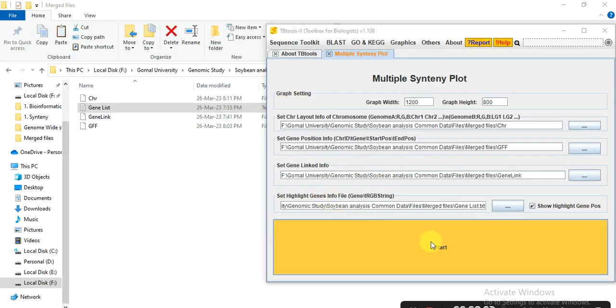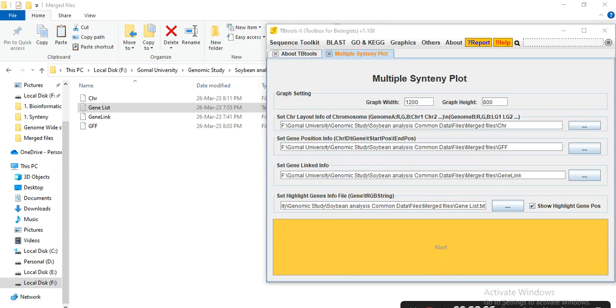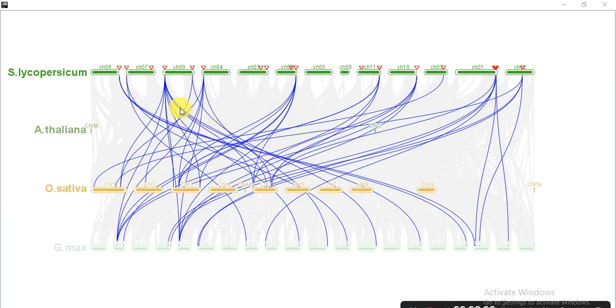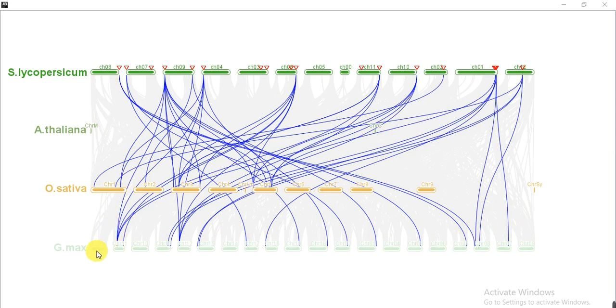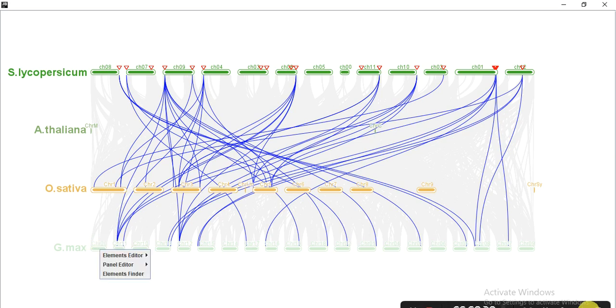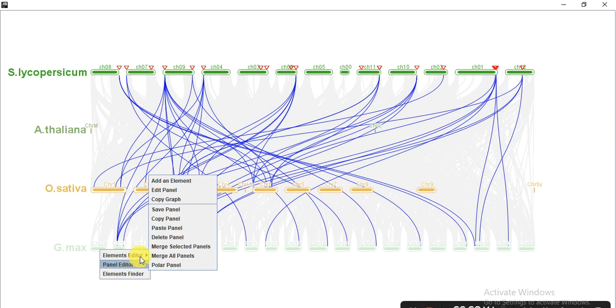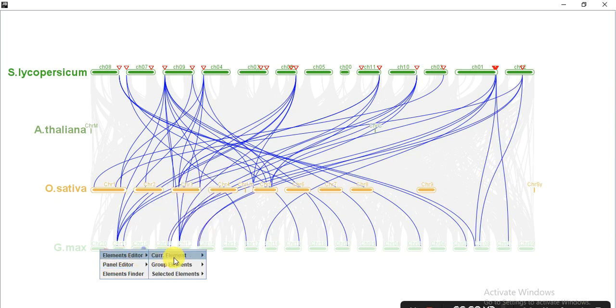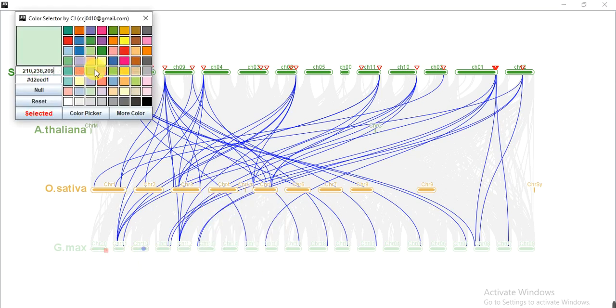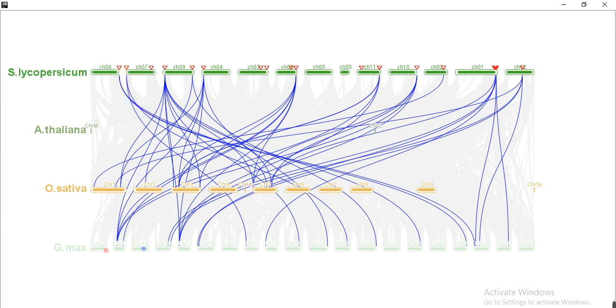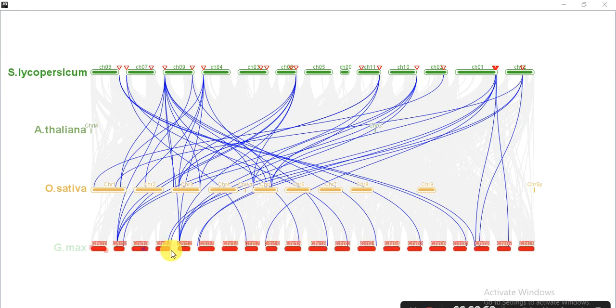So after putting the files, click on start. So it shows that these are our Solanum lycopersicum genes, HSP-70 family genes, with these Oryza sativa, Arabidopsis or G.max genes. We can change the color of these chromosomes. So you can place the cursor, right click, then element editor, group element, and here you can choose any color. Like I want this red color. And select.